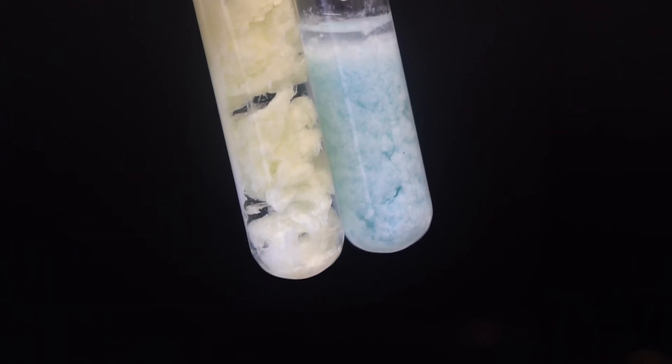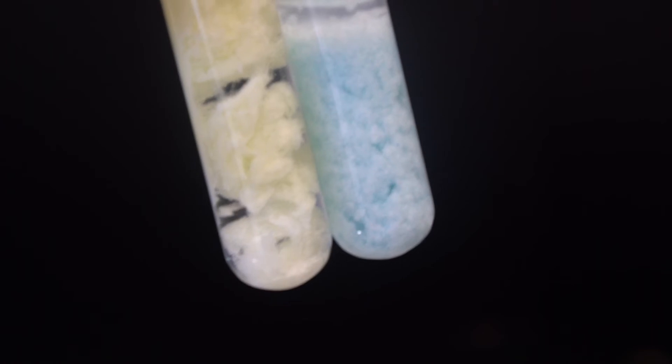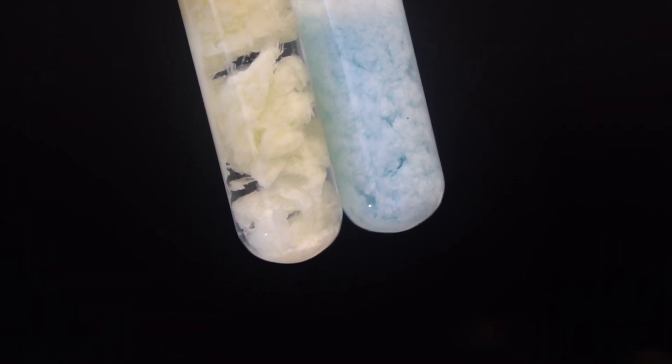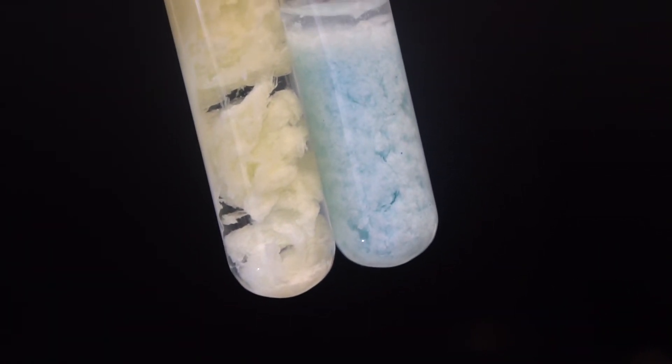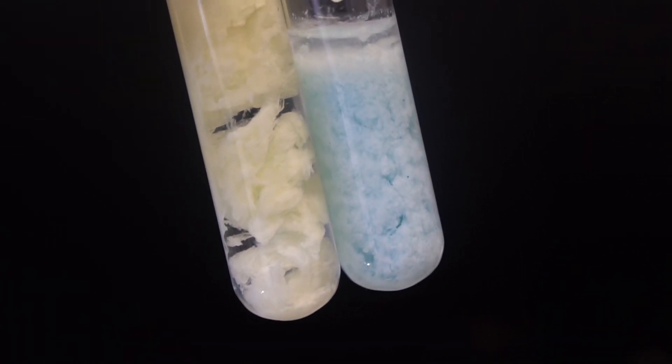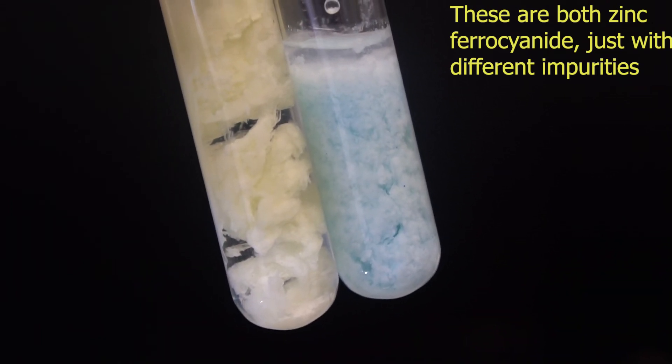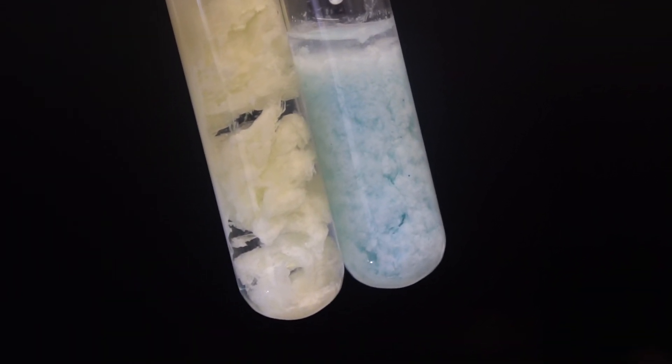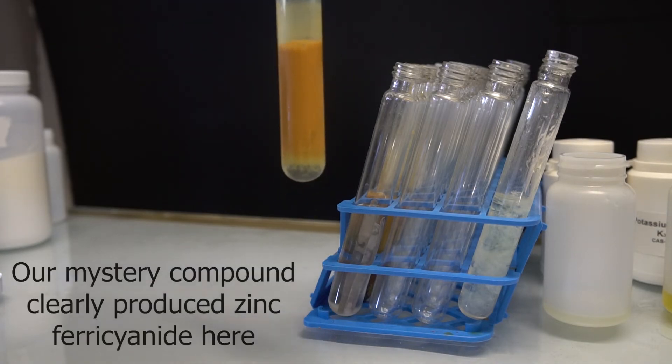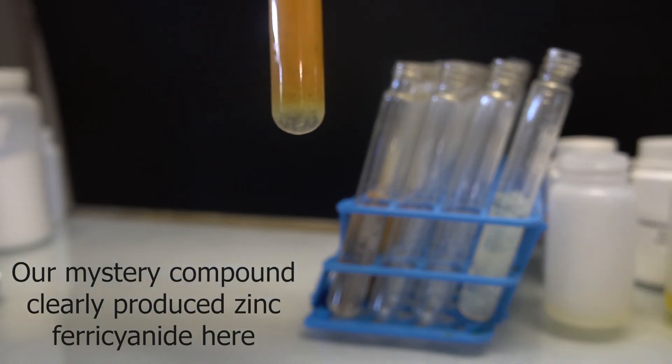So now it was finally time to test our mystery substance, which we had dissolved in hydrochloric acid. Reacting this with potassium ferrocyanide gave a slightly bluish precipitate with exactly the same texture and consistency as the previous zinc ferrocyanide precipitates. Reacting with potassium ferricyanide gave an orange-brown precipitate.